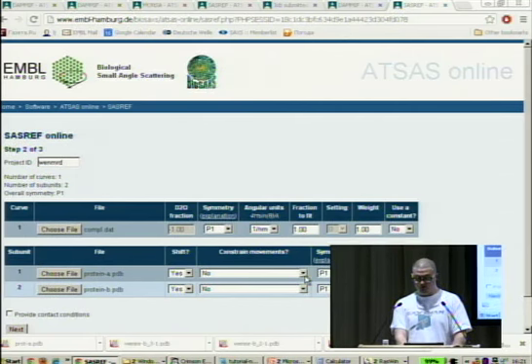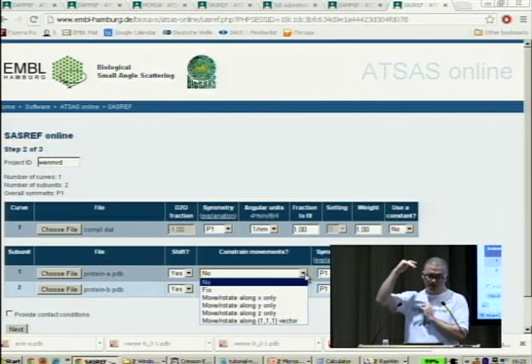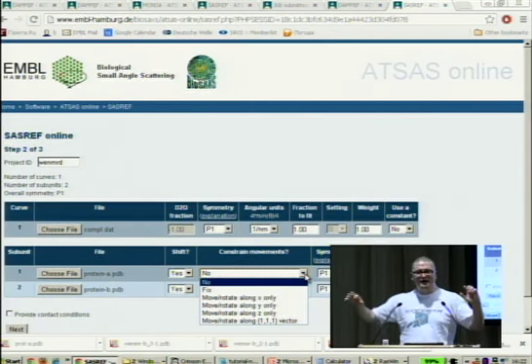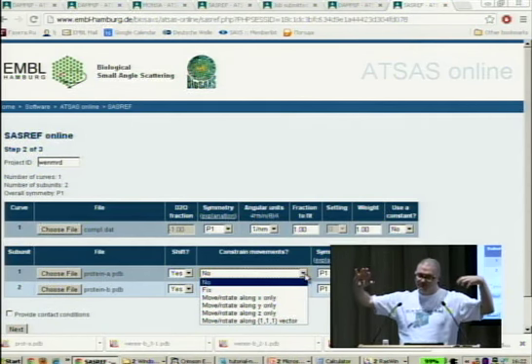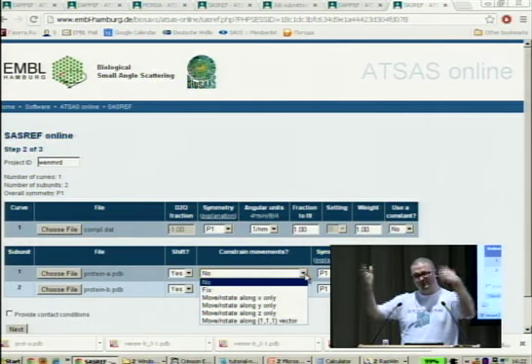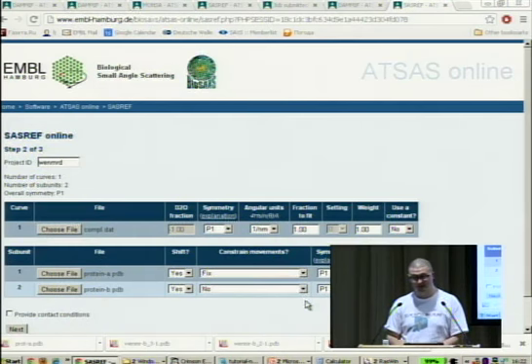So besides, we have the option to constrain the movements. So for example, we can fix one of the subunits, then this subunit's position in space will not be changed. Or we can restrict the movements of the subunits. For example, if you have relative orientation of the subunits from NMR RDCs, then you can prearrange your subunits and then tell the program that they shouldn't be rotated against each other. So let's fix the first subunit and do not touch the second one. Actually, we could say that both should not be fixed. And yeah, in this case, one subunit will be moved to the center of coordinates and the other one will be moved around it. Probably it's better to say that they both should not be fixed. If you fixed one of them, it's slightly faster.